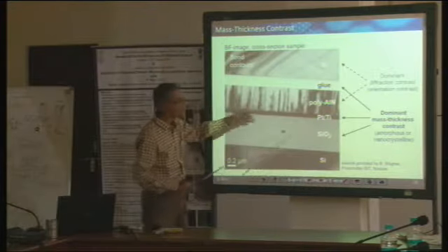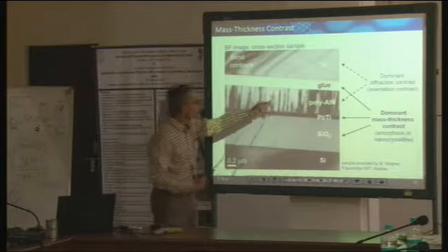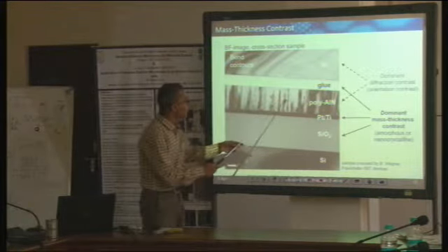Yeah? This contains maybe columnar grains. This, let us say, is one column, another column. So this is a columnar grain. This is one grain. This dark one definitely must be another grain, and then there is another grain and so on. But it is columnar grain.